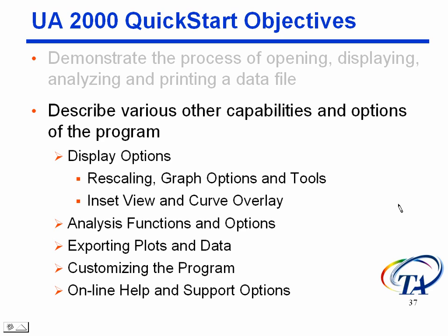Those are covered in detail in the next course, but I'd like you to walk away from this knowing that they exist. You can explore them on your own, and then if you can't figure it out, there's online help, and you can always call the hotline and then take the next class. Then we'll get into those two functions: the inset view and the curve overlay.